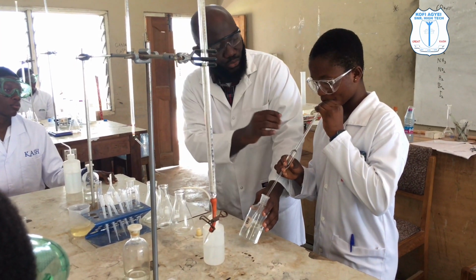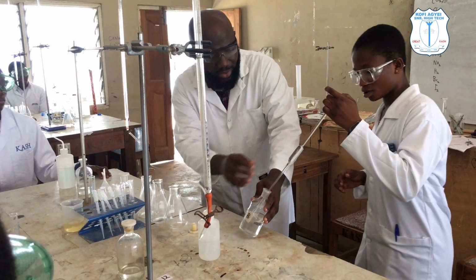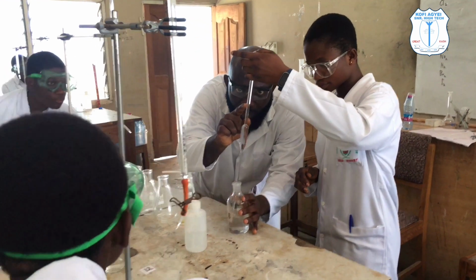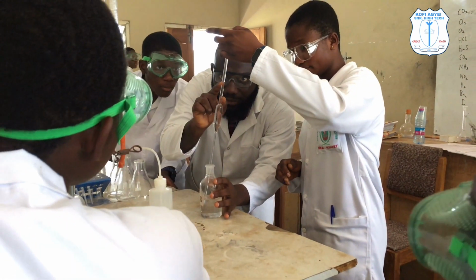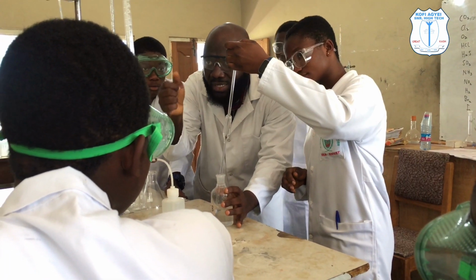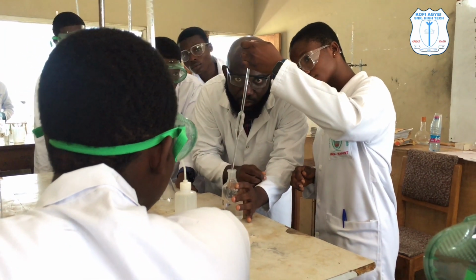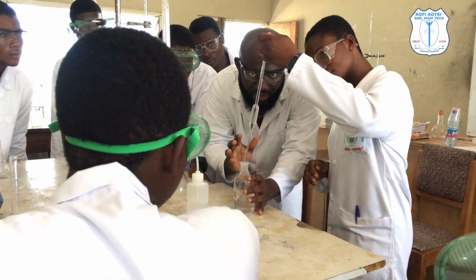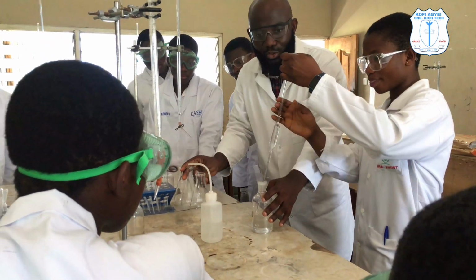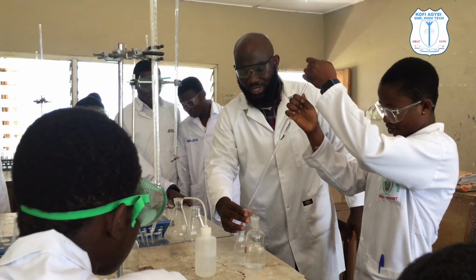Now withdraw nicely and apply a thumb. Now you straighten it nicely. Please get closer. Have you seen the mark over here? So she's going to adjust it to that mark. Do you get it? By moving your thumb gently. So take your time, gently. It's okay. Now hold it tight, remove the pipette. Then release it gently into the conical flask.